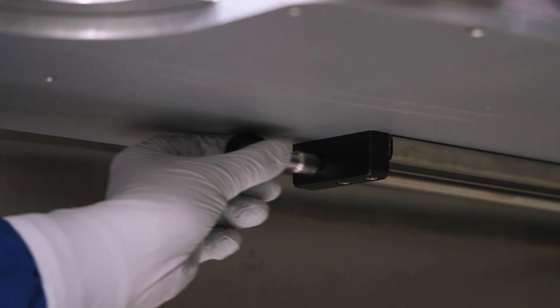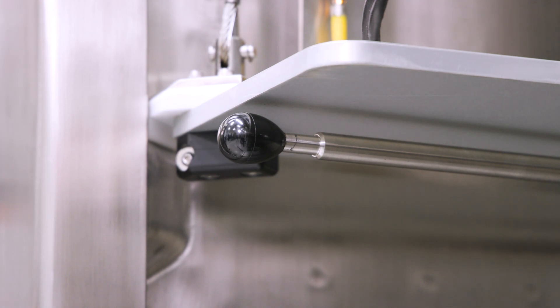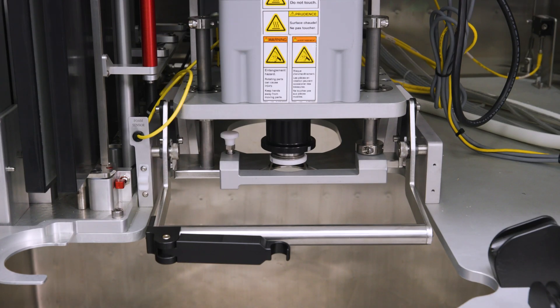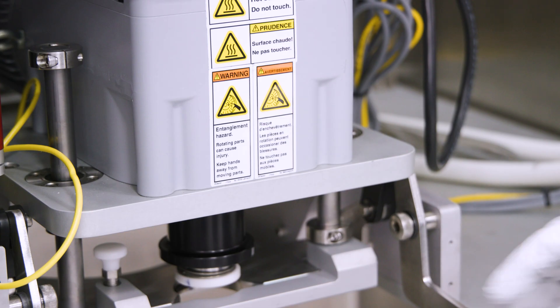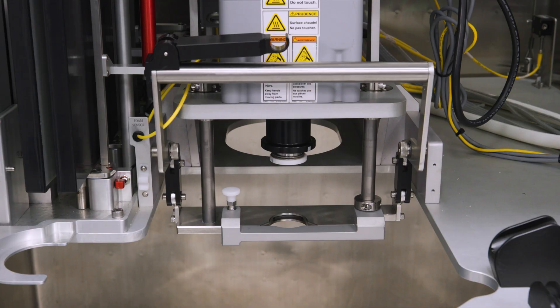Note: the top back retractor clips need to be pulled out prior to installing the top back tabs. Next, lock the top bearing hub into the down position. This is accomplished by positioning the mounting shaft in the down position by moving the handle up.